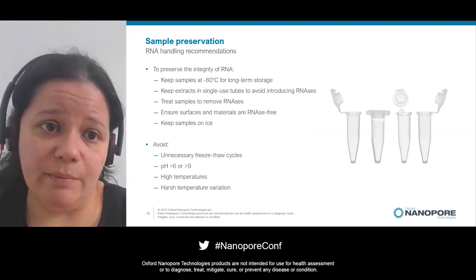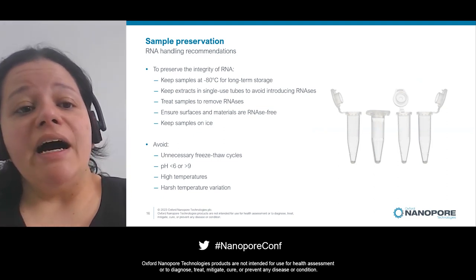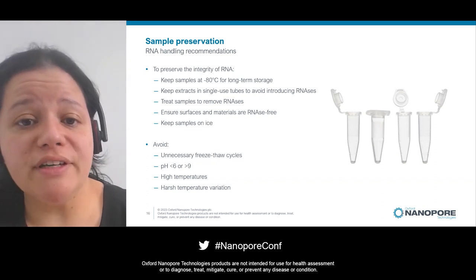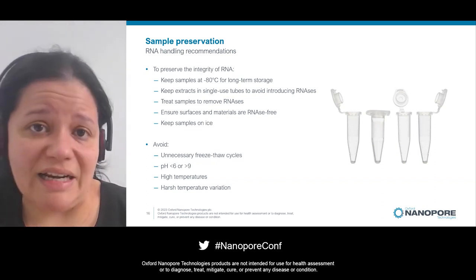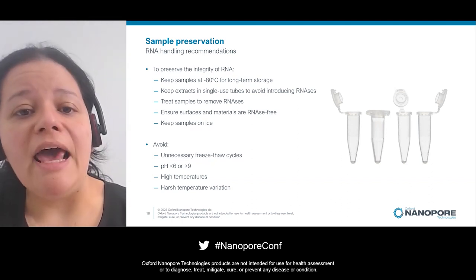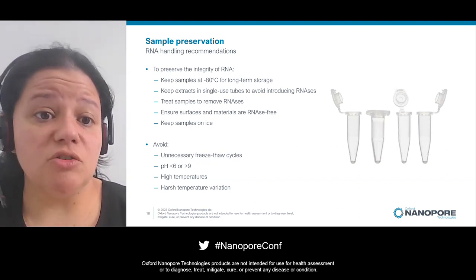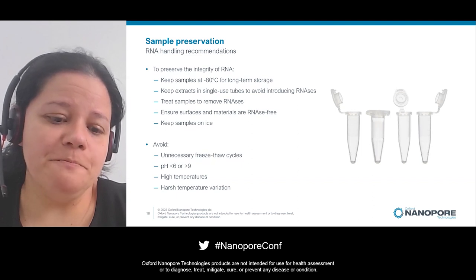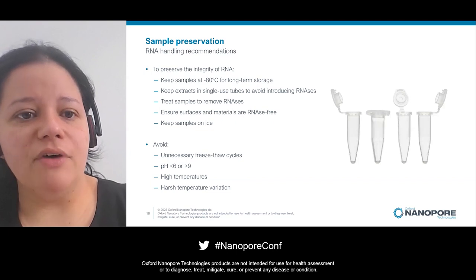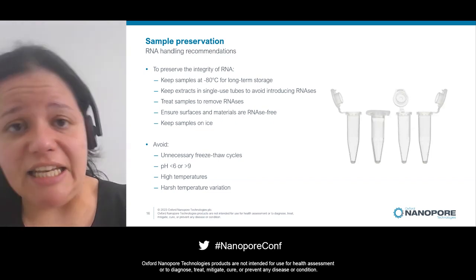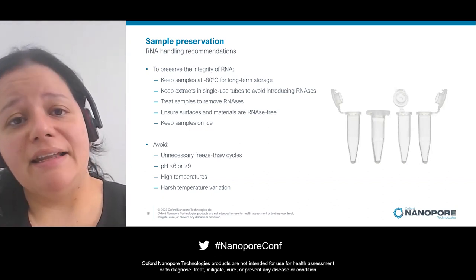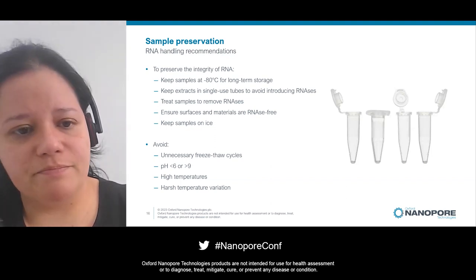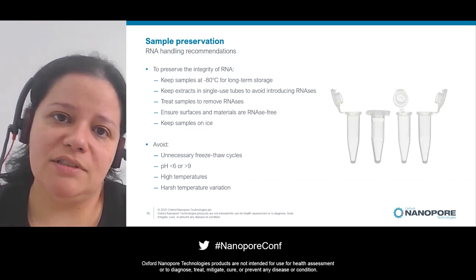Avoid exposing your sample to really high temperatures and avoid introducing any DNases. For RNA, keep extracts at -80°C especially for long-term storage. Ideally keep extracts in single-use tubes — for RNA this is not just to avoid freeze-thaw cycles but mainly to avoid introducing RNases by repeatedly opening and closing the same tube. Treat surfaces with RNase-removing solutions, keep samples on ice, and avoid temperature variation.